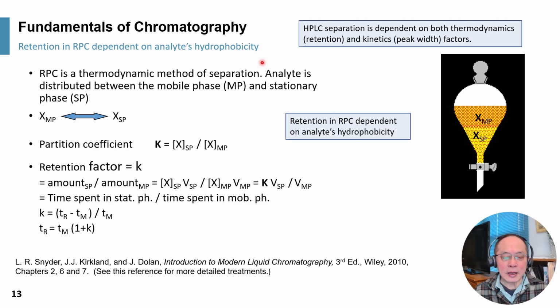In this slide, we explain a little bit further on the fundamental chromatography. We are actually drawing a similarity between the retention under reverse phase condition and that of a partition coefficient. So reverse phase LC is a thermodynamic method, so we can describe the retention separation process with the distribution between the mobile phase and the stationary phase.